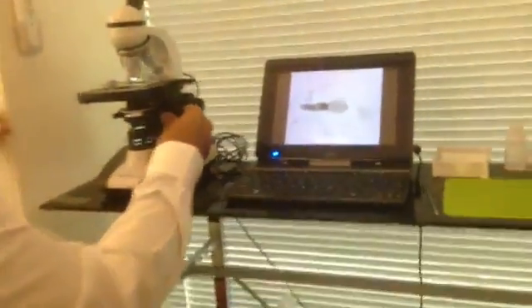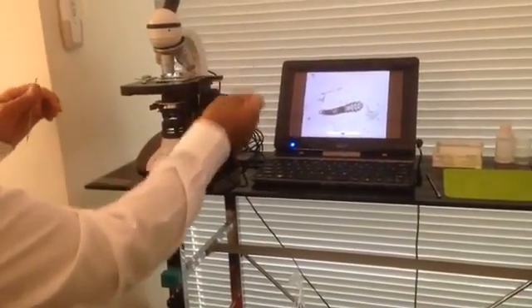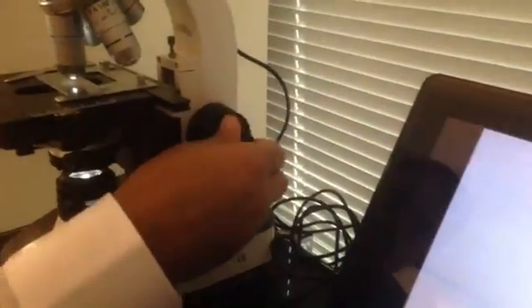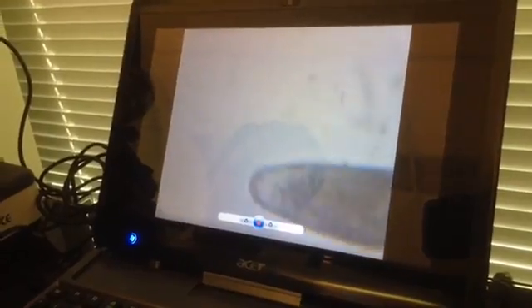We may try to use this with the other view. We can show here how we usually come here and change the settings — we go to 40 times and try to use the fine tuning. That one's not so good. It takes some time. All right, we are very close now.